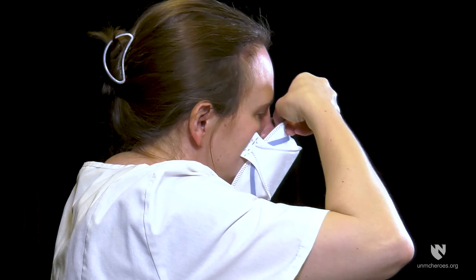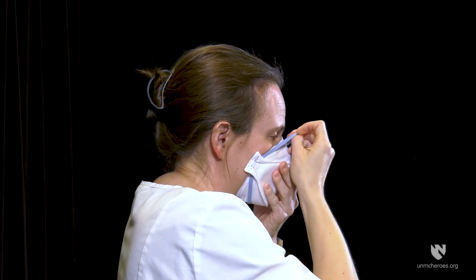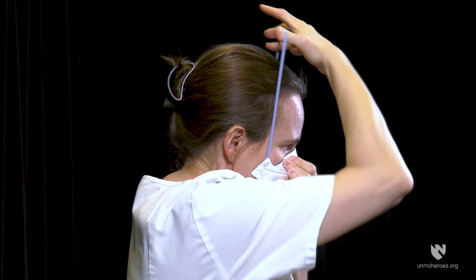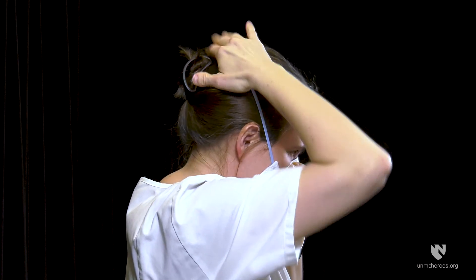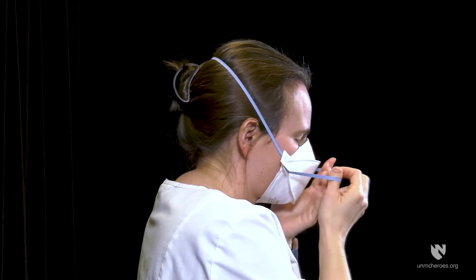Place respirator on your face. The foam rests on your nose, the bottom panel securely under your chin. Pull the top strap over your head and position it at the crown of the head. Pull the bottom strap over your head and position it around the nape of your neck.